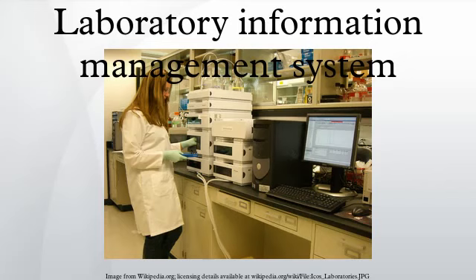As personal computers became more powerful and prominent, a third generation of LIMS emerged in the early 1990s. These new LIMS took advantage of the developing client-server architecture, allowing laboratories to implement better data processing and exchanges. By 1995, the client-server tools had developed to the point of allowing processing of data anywhere on the network. Web-enabled LIMS were introduced the following year, enabling researchers to extend operations outside the confines of the laboratory.